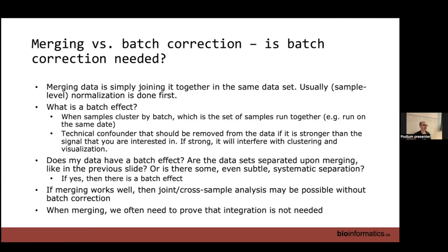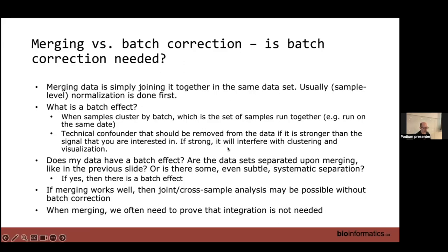The first question is whether batch correction is even needed. Merging is simply joining the data together in the same dataset — we normalize first and then join. We then need to assess whether there's a batch effect present. A batch effect is when some samples cluster by batch — a set of samples run together using a particular day at the core facility or a particular technology. It's a technical confounder that should be removed from the data, especially if it's stronger than the signal we're interested in. If it's fairly weak and doesn't outcompete our main signal like cell types, we might not need to worry about it.